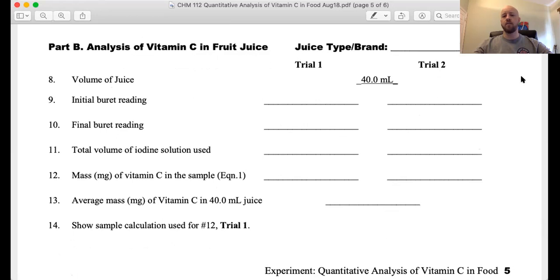And like I said, then you can take that and you can calculate the vitamin C content of a peach. And there's a Wikipedia page that lists the actual content, so you can gather that information from the wiki page as well and include that in your report. All right. So that is it for the vitamin C titration.